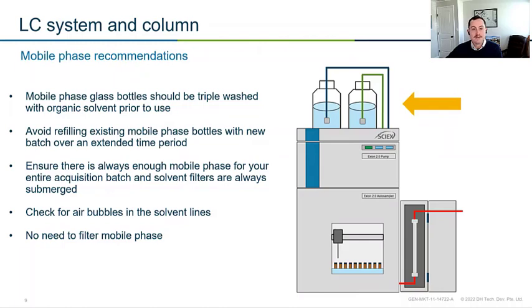So purge your system and then go ahead. Don't forget to put them back. I've done that. Your data will look quite bizarre if you forget to switch them, but switch them back and then purge again. So it's just an easy thing to do every few months to ensure there's no buildup of salts in your pump.